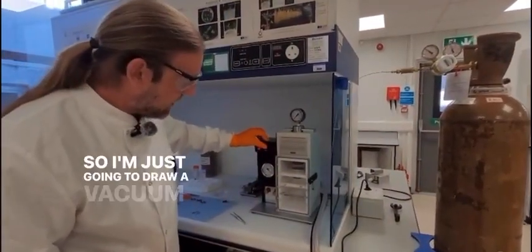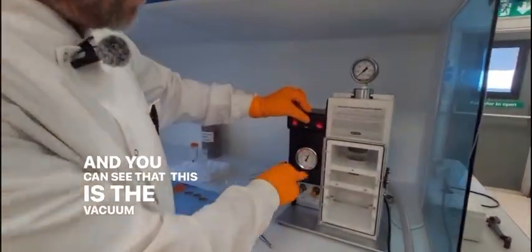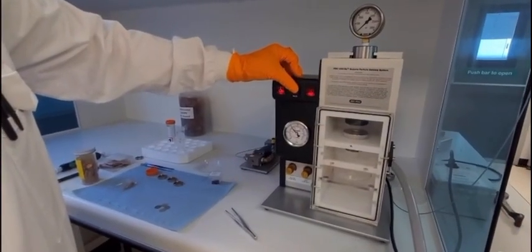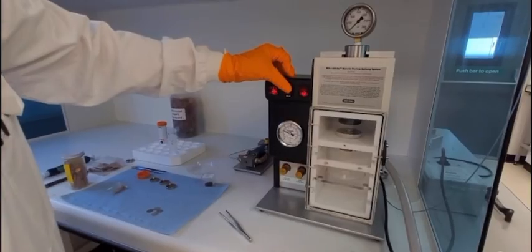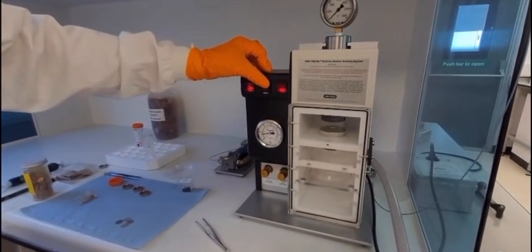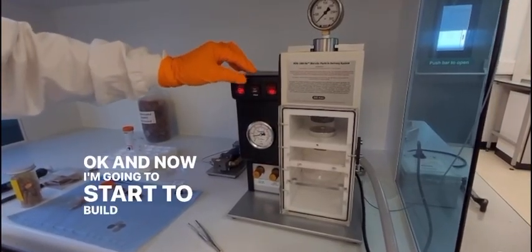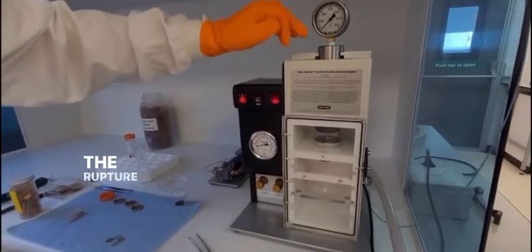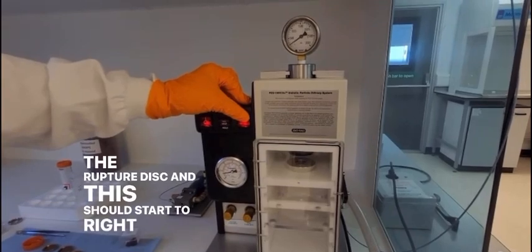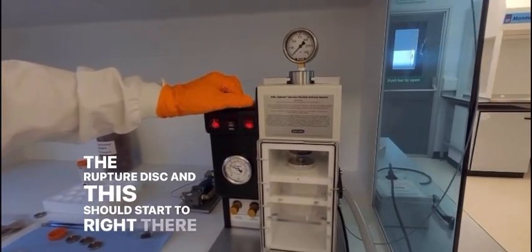So I'm just going to draw a vacuum now. And you can see that this is the vacuum I'm drawing. Okay. And now I'm going to start to build up the pressure behind the rupture disc. There we are.